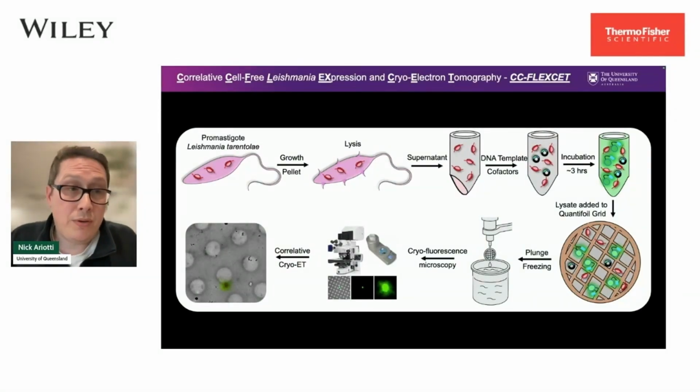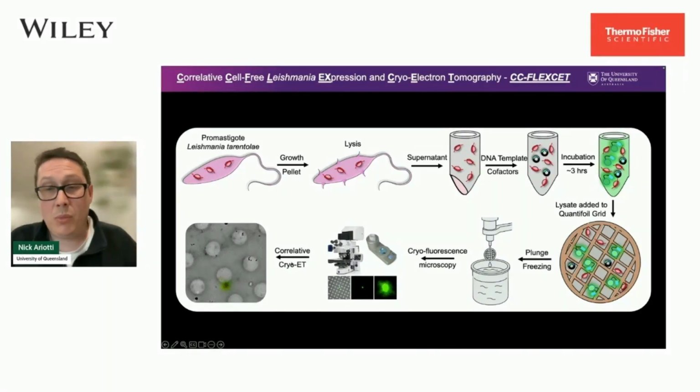It's important to note that all of this can be done within a single day. You can start your expression in the morning, then plunge freeze after 3 hours and do some fluorescence-based targeting around lunchtime for data acquisition on the cryo-TEM overnight.